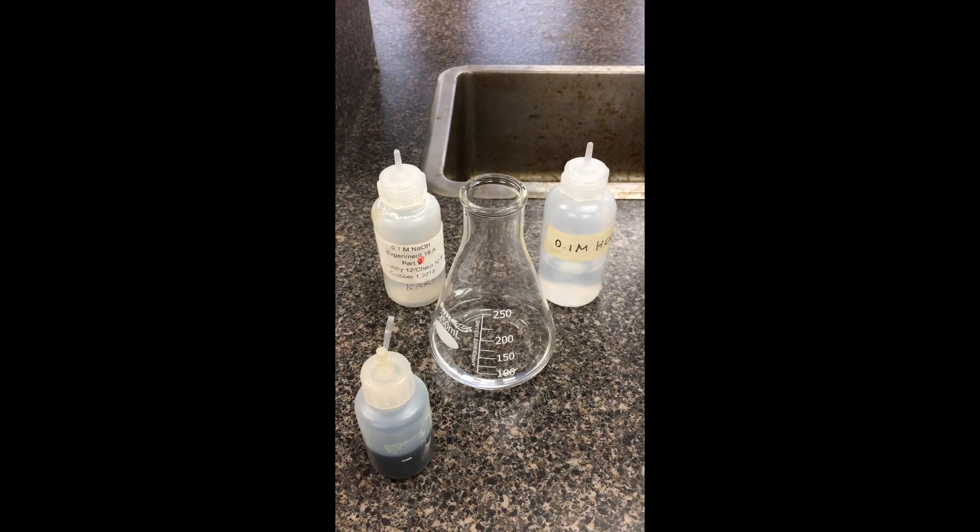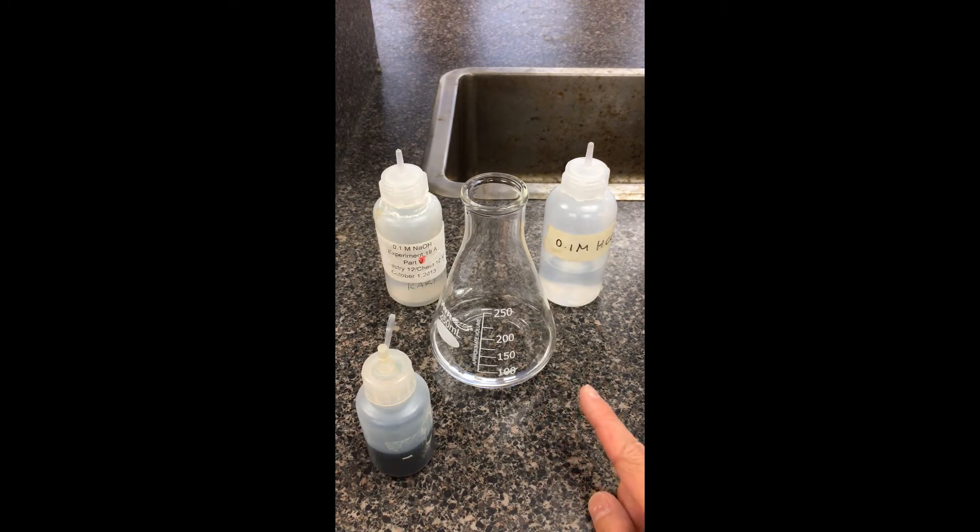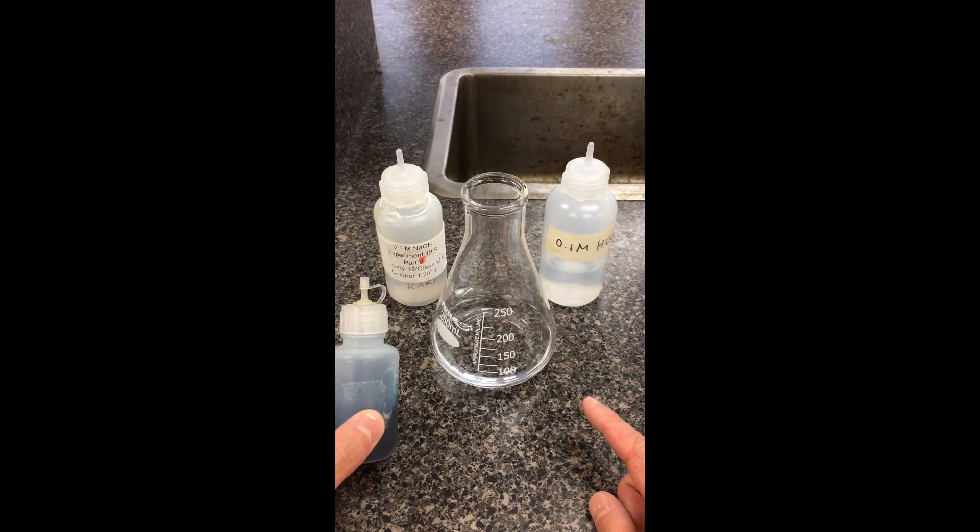In this lab we're going to be investigating several chemical equilibria, doing this in stations. Our first station involves 50 milliliters of distilled water in this Erlenmeyer flask. We're going to be analyzing a chemical indicator — this one here is thymol blue.